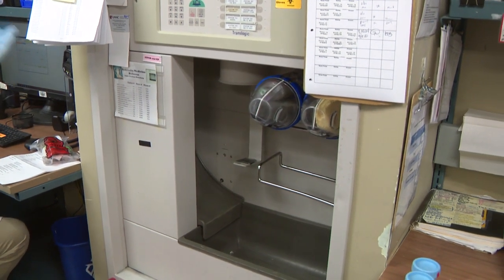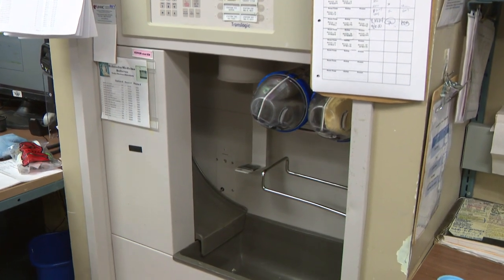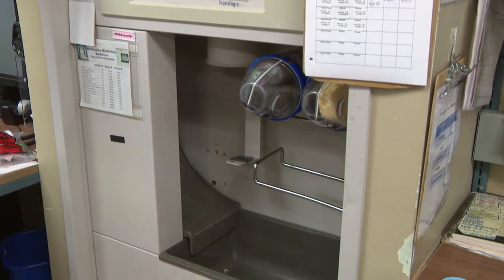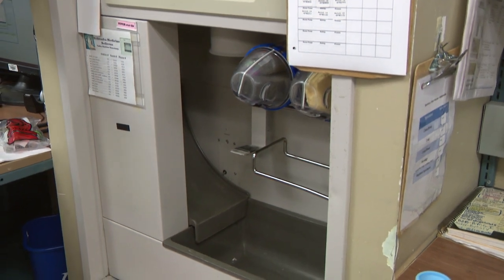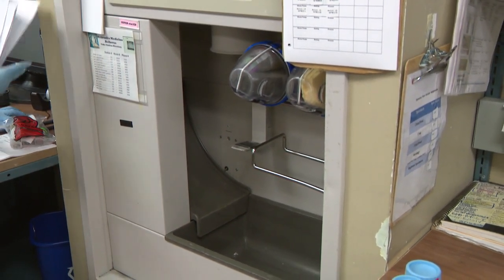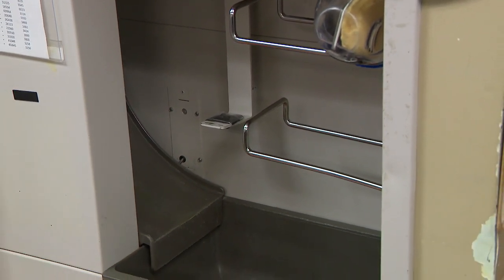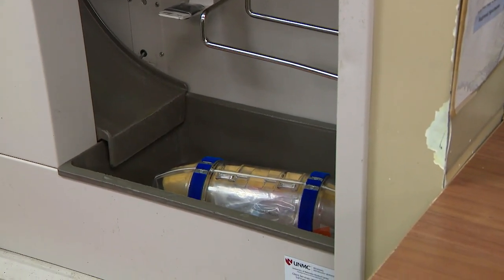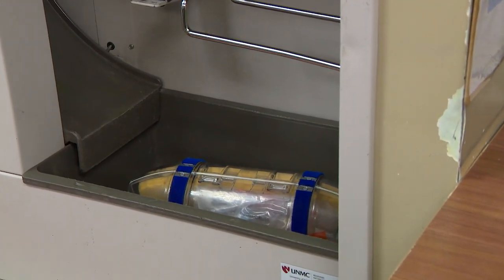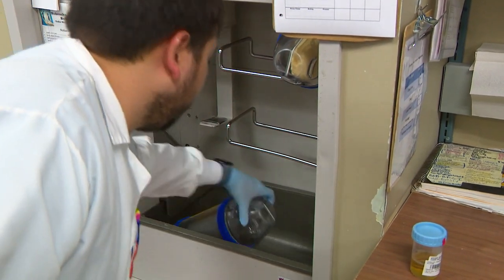This is a tube station. It's hooked up to all the hospital — this is how we send or receive things. We mostly send paperwork up to the clinics or to different floors, but the floors and the clinics send us down most of their samples through this tube station. When a tube comes down, it'll drop over on this side and just kind of fall in here. Once we see that there's a tube down there, whoever is in specimen processing will go up and grab it.